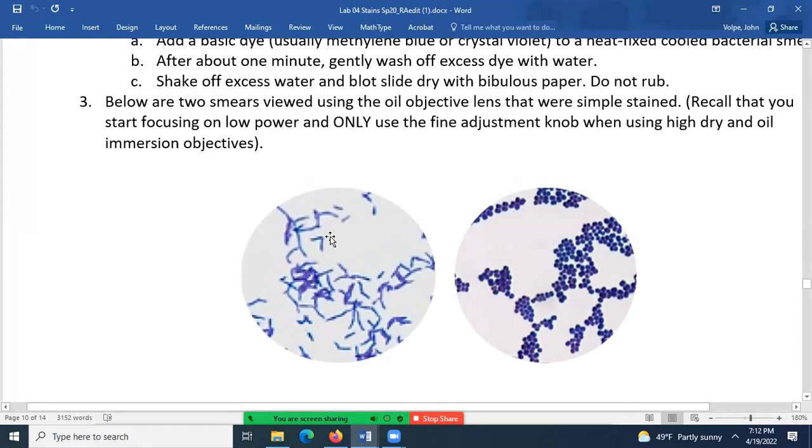This almost looks like a spirilla right there, but that's because the cells are hooked together. If you look at only the singlets, you'll note that the E. coli singlets are all bacilli.